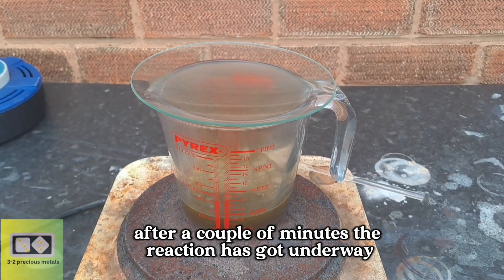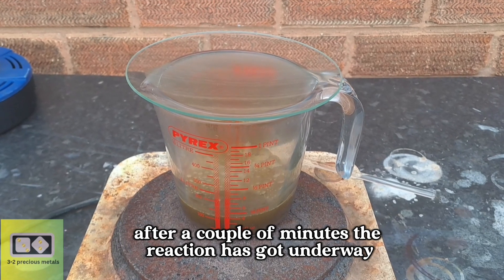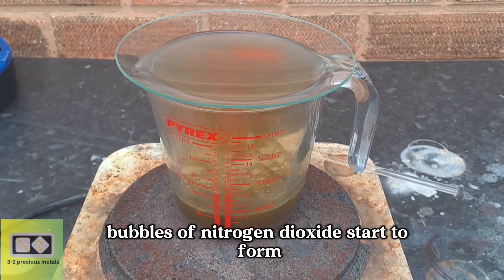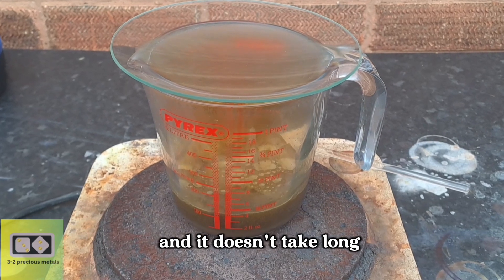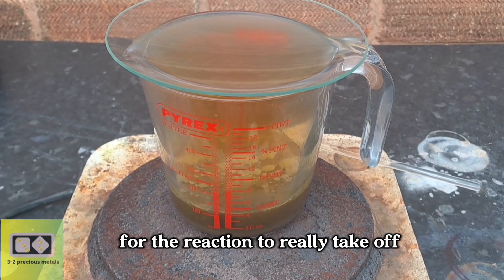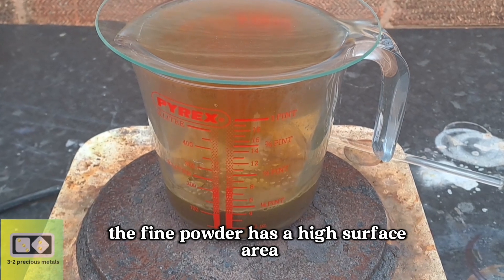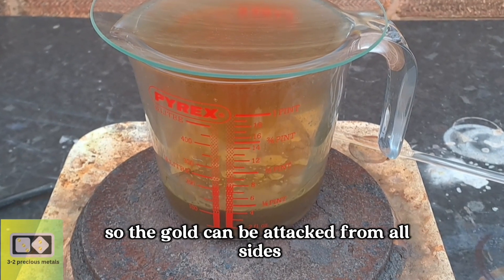After a couple of minutes, the reaction has got underway. As the gold dissolves, bubbles of nitrogen dioxide start to form, and it doesn't take long for the reaction to really take off. The fine powder has a high surface area, so the gold can be attacked from all sides.